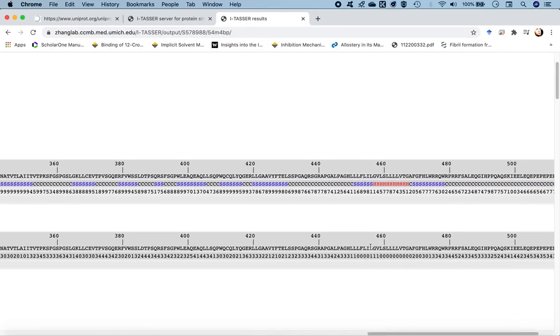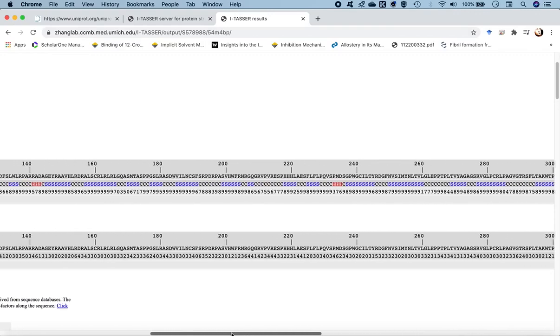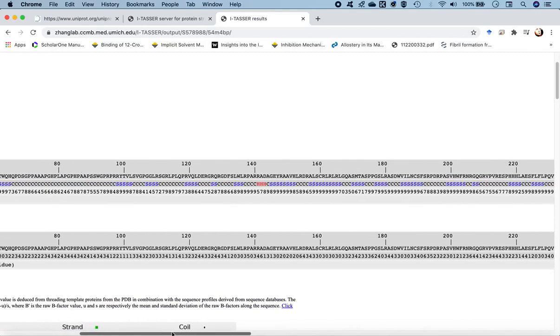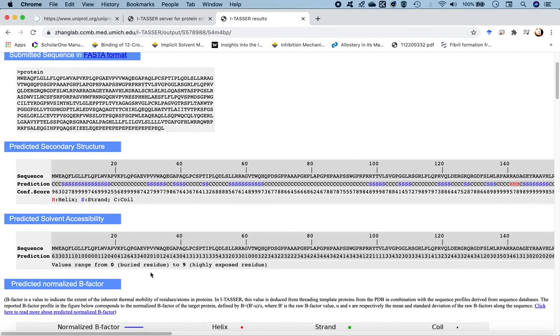Okay, so towards the end, as we reach the C terminal, you also find the D4 domain, and the last bit here is the intracellular domain. So this part is basically buried inside as well. And for that matter, none of the residues actually hit 9. So we can say that not many of the residues are exposed in nature. The more exposed the residues, the more the propensity of them forming a random coil structure. So it's a very structured structure, to put it that way. That is, it has a lot of tertiary structural features having secondary structure folds.